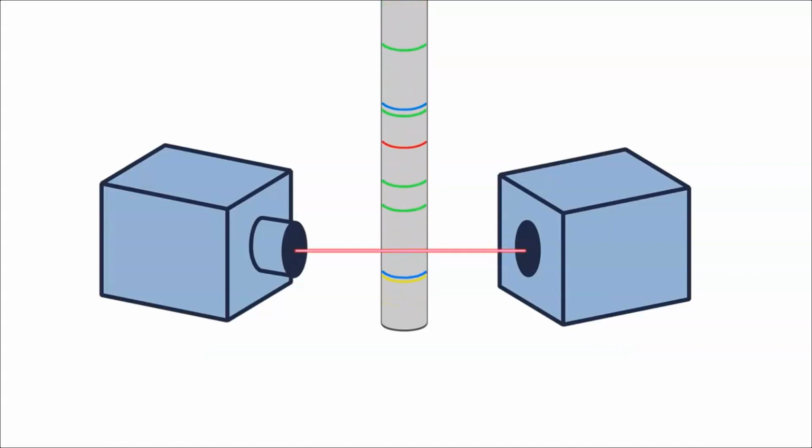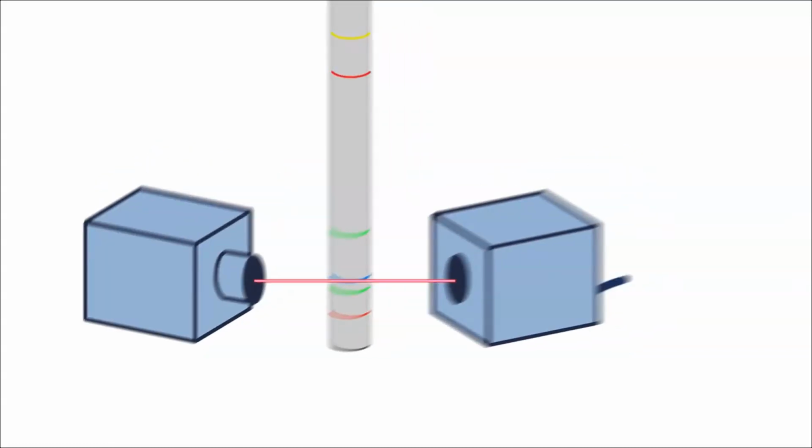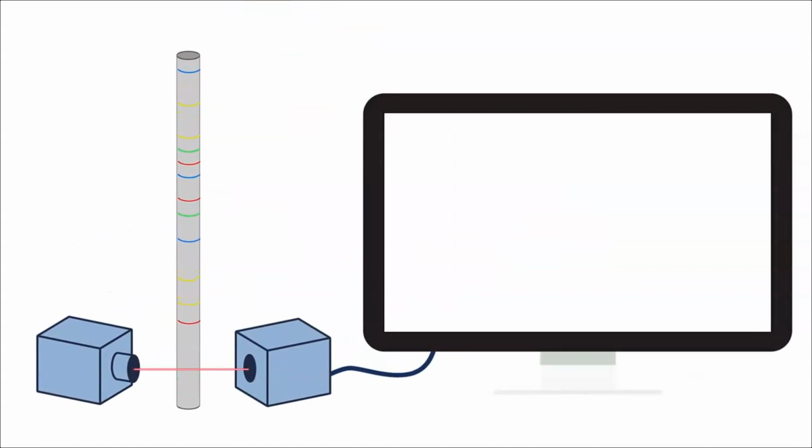Optical detectors determine the color of the fluorescence and relay this information to the computer. The color of the fluorescent tag identifies the nucleotide at the end of each fragment. Remember, red is thymine, blue is cytosine, yellow is guanine, and green is adenine. Because yellow can be difficult to see, the computer converts the yellow to black.